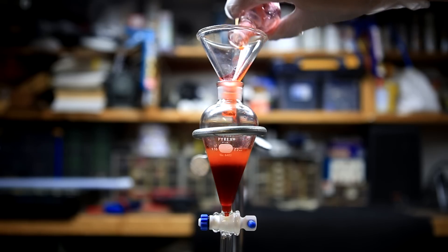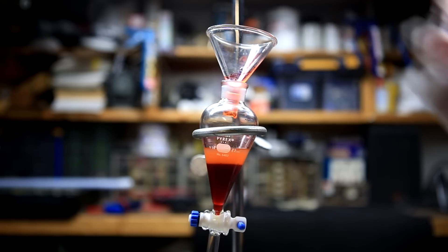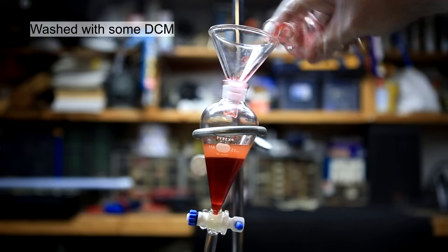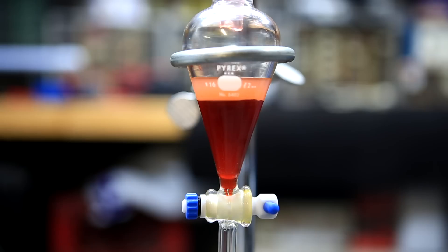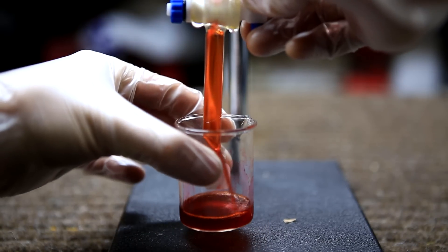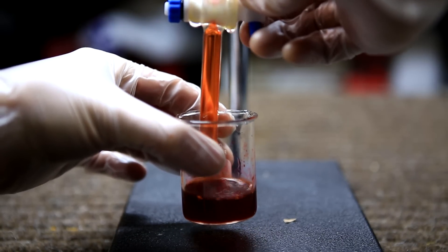This mixture was then transferred to a small separatory funnel. The round bottom flask was washed with a couple ml of DCM. The contents were mixed thoroughly and then the layers were allowed to separate. The lower layer containing our desired product phenolphthalein is drained into a beaker.